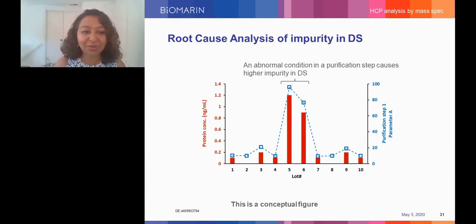So there's a lot of possibilities for developing robust processes so that one doesn't have any issues in commercial manufacturing. And also if there are site-specific issues or there are issues with cells in harvest having growth problems or other things that people do see during process development, then one can correct them before building a final robust commercial process.